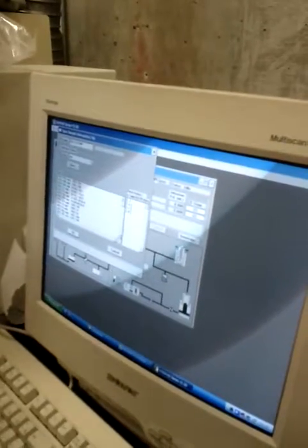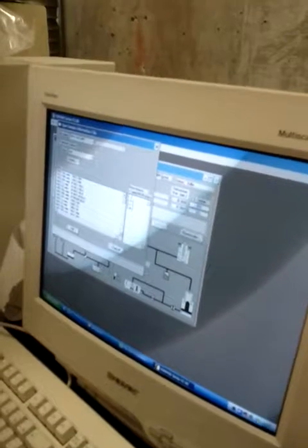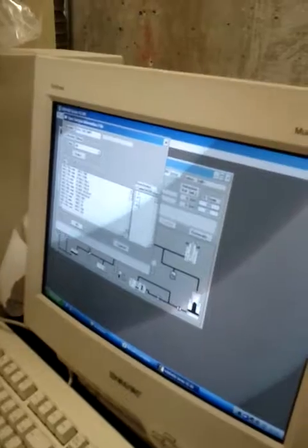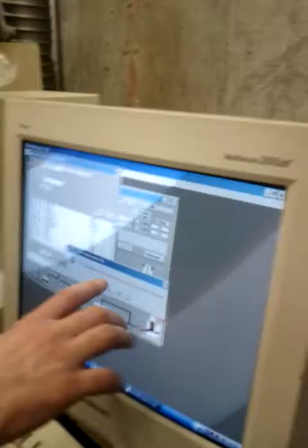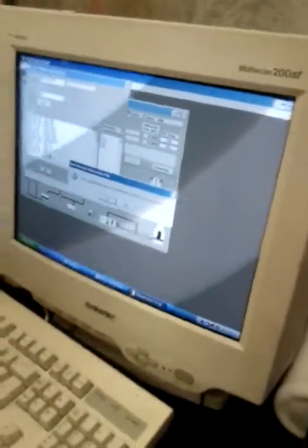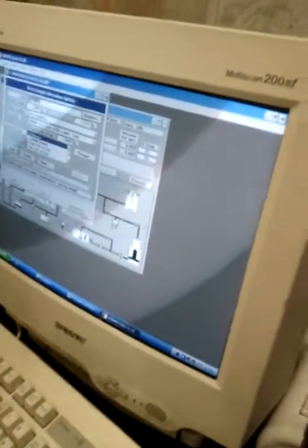And because it's the first, we got 2 samples, so we will have the A and B. And here it will say that this sample does not exist. Do you wish to create it? Yes. And now we have other information to run it. So sample weight, it's the weight that has been measured for the first one. 0.8.